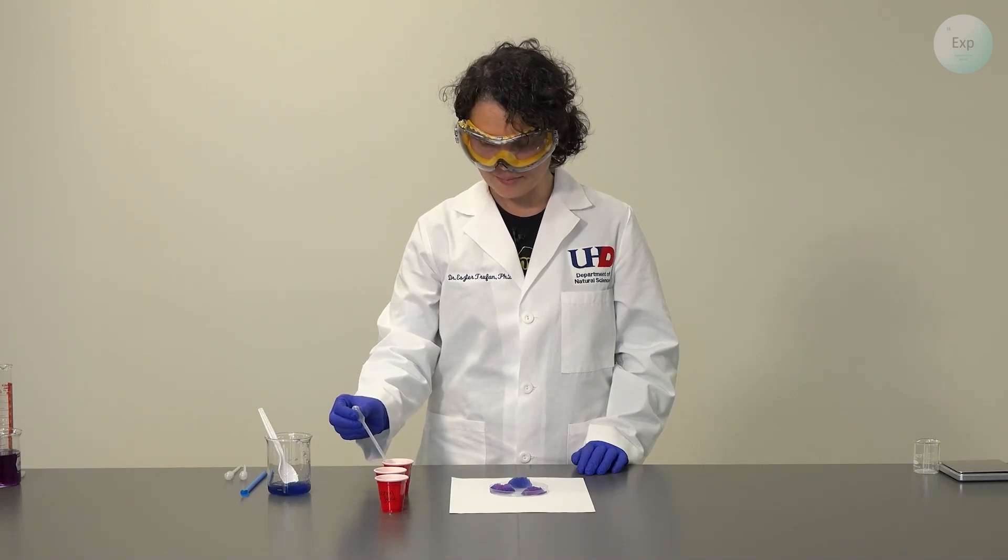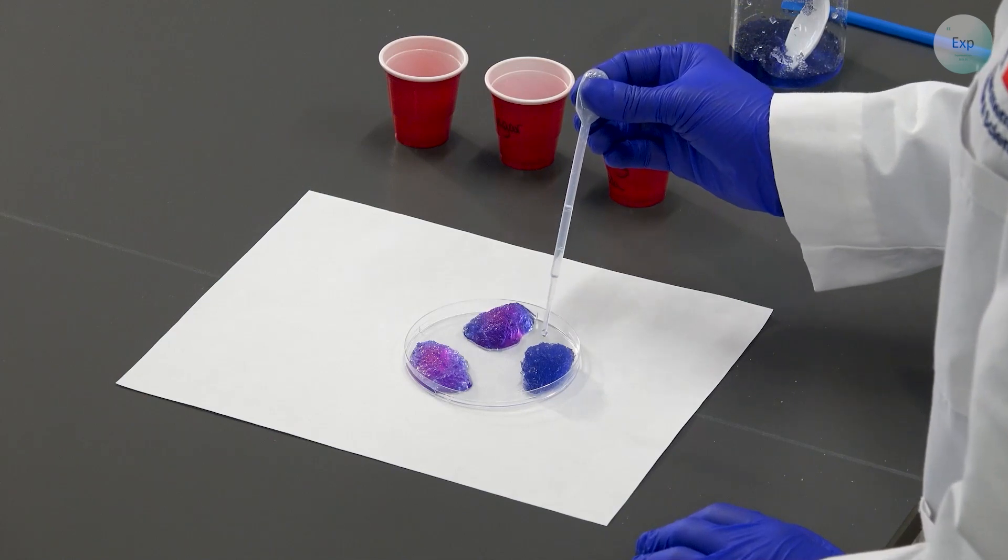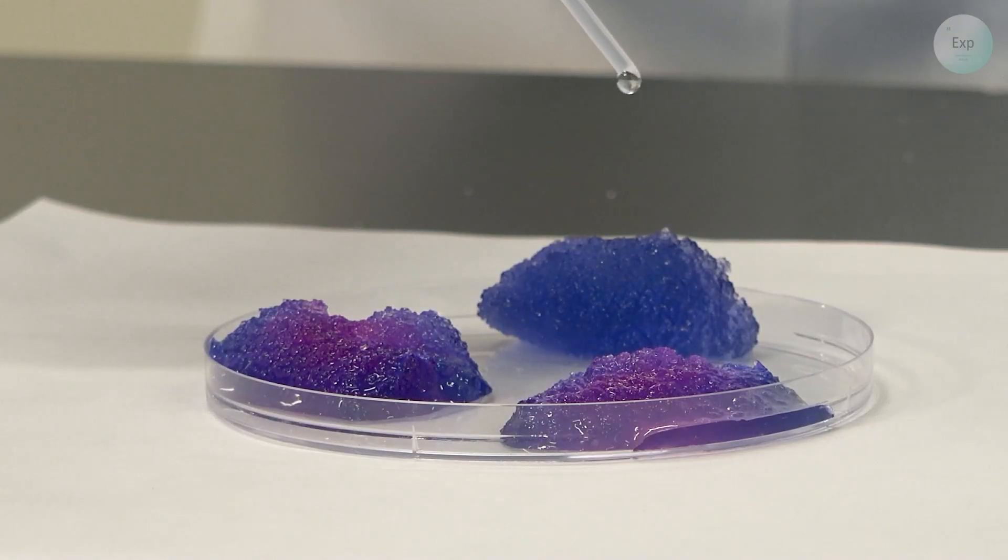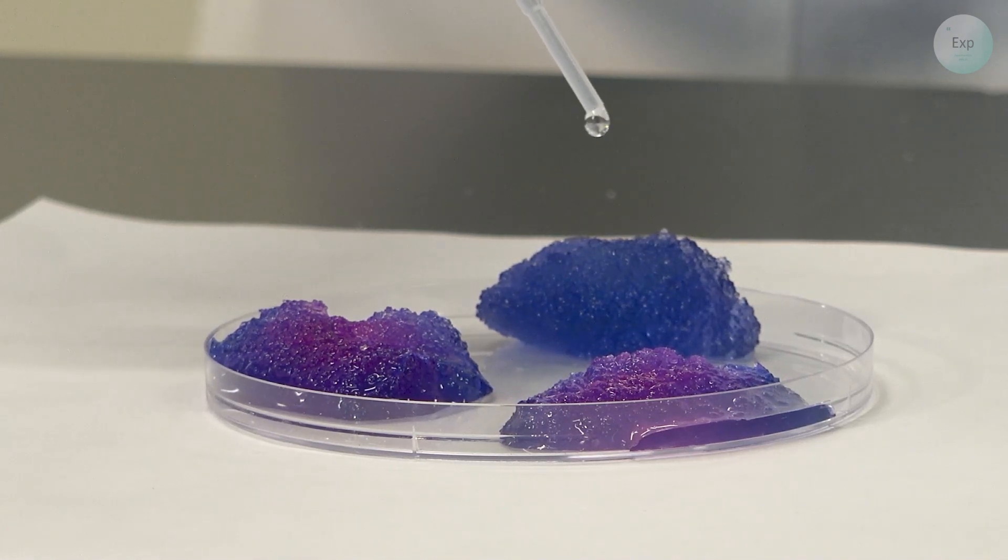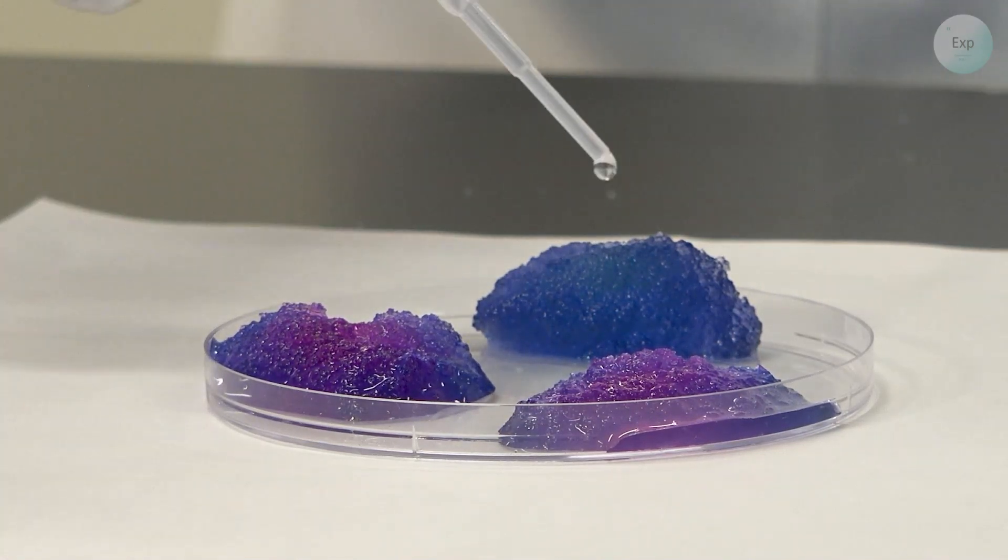Finally, we're going to add some saturated baking soda solution to the third one. It is already changing colors a little bit, but if it's still not clear, we can add more.